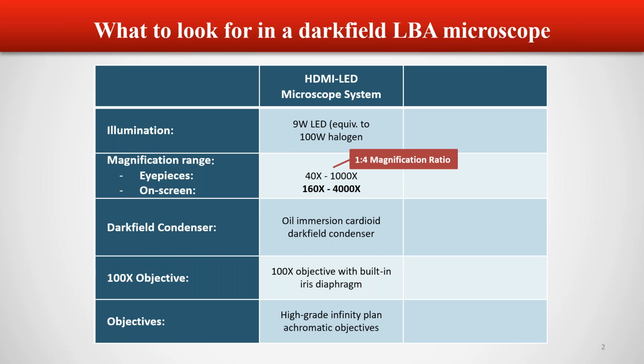But in some cases where there's a small structure moving around, perhaps a bacterial form or a pleomorphic growth form in dark field that you need to look at in higher magnification, you're then able to use this 100 times objective, and then you achieve a magnification of 4,000 times on the screen, which is really quite amazing to have. And that's what you need to see the microbial forms, yes?